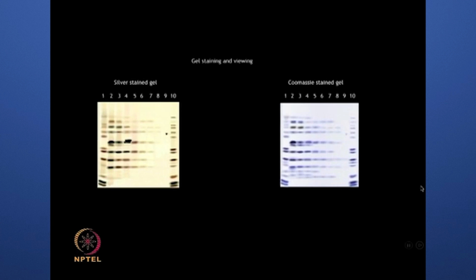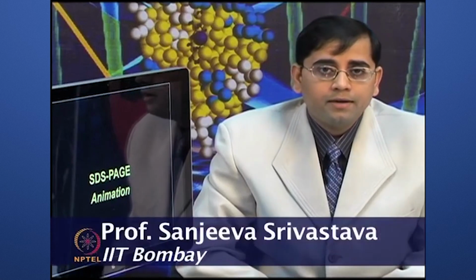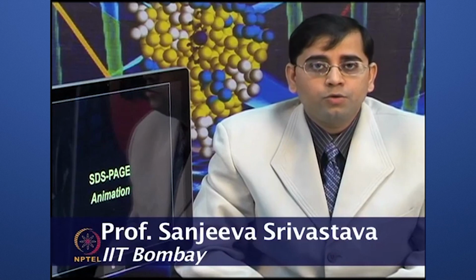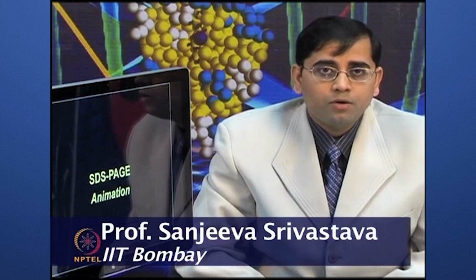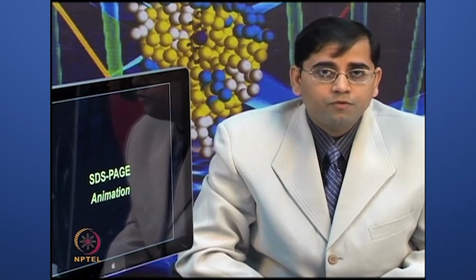You can load the molecular weight marker or the standards as shown in the first and the last and the 10th well, and then the protein samples for which you want to determine the molecular weight can be separated in different wells. So, I hope after looking at this animation, you are now clear how to make a gel to separate proteins based on their molecular weight, and I will show you later one laboratory demonstration of how to use an SDS PAGE gel for separating proteins in 2-dimensional electrophoresis.